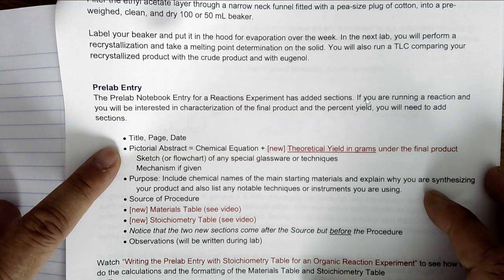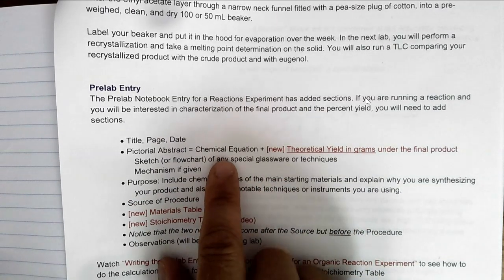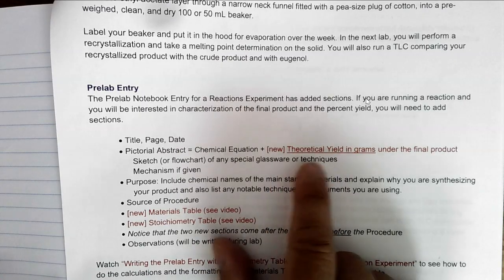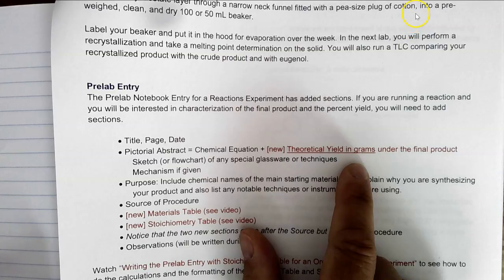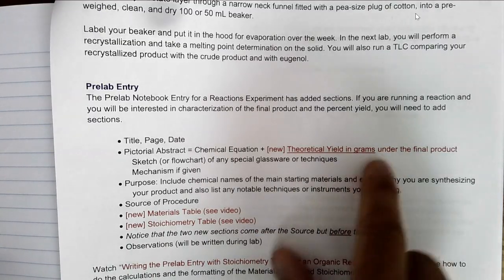Next comes a pictorial abstract. For the reaction, you should really put the chemical equation, and then underneath the product, you're going to give us the theoretical yield in grams. How much product would you expect if everything goes perfectly? And so I'll show you how to do that calculation. So anything in red is actually new.